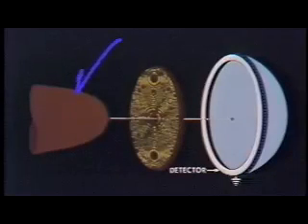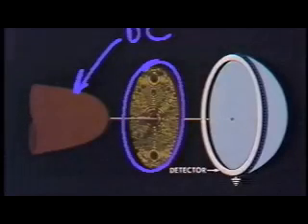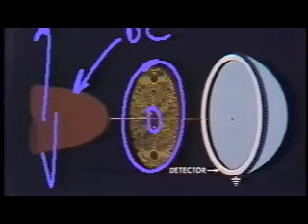We put a DC voltage onto the specimen and we create a field ion microscope image. Right? But we're clever. We put a little hole in the field ion microscope screen. And then we provide a facility for moving this tip in X and Y so that we can shift this image, right, over the hole until something in the image, like that precipitate particle we were interested in, till its image falls over the hole.